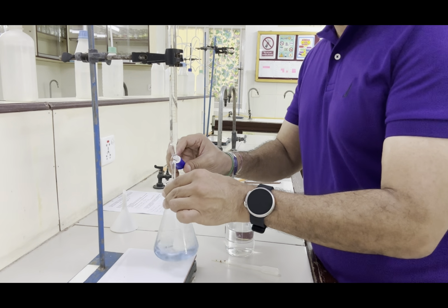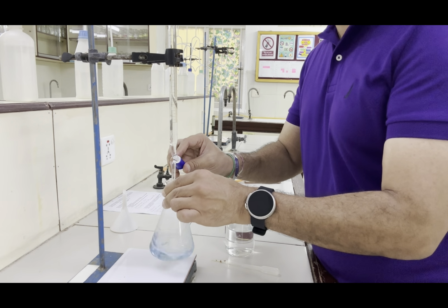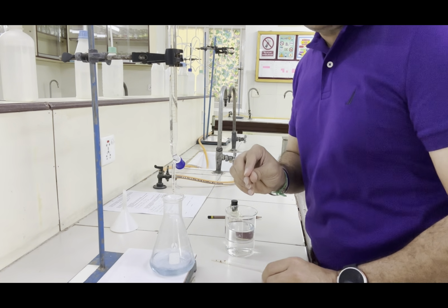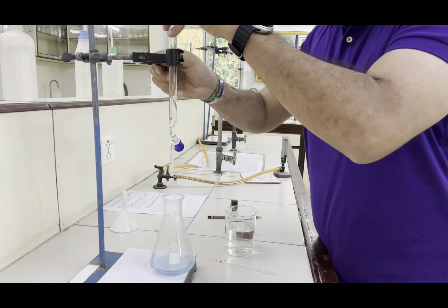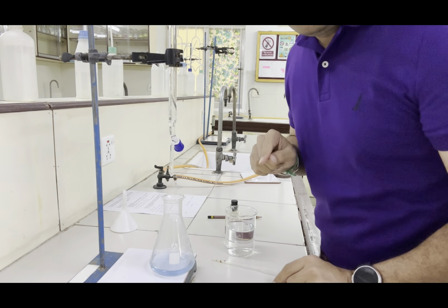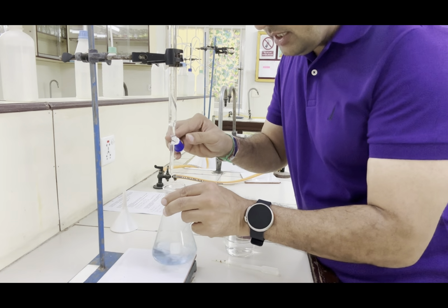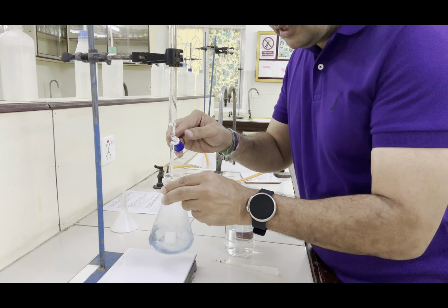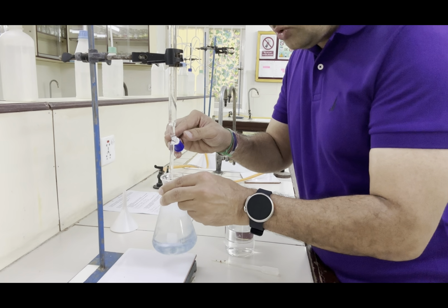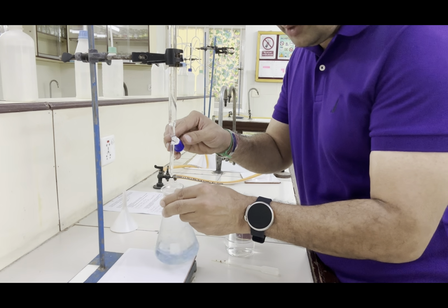So I am adding a bit faster till I reach 27, 28. And then I will stop, and now I will open this and add drop wise. I will continuously swirl this flask so that as soon as the solution goes from blue to yellow, I will stop, and that must be the accurate titration.